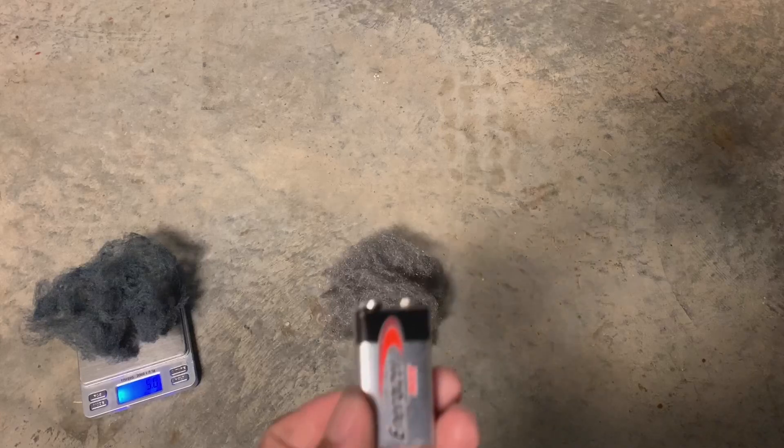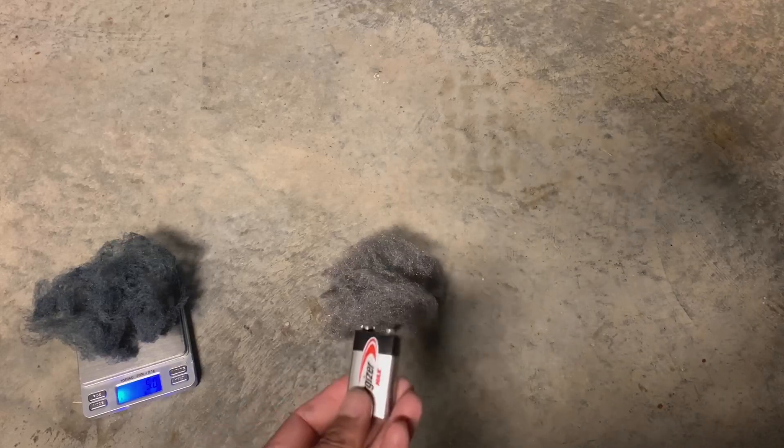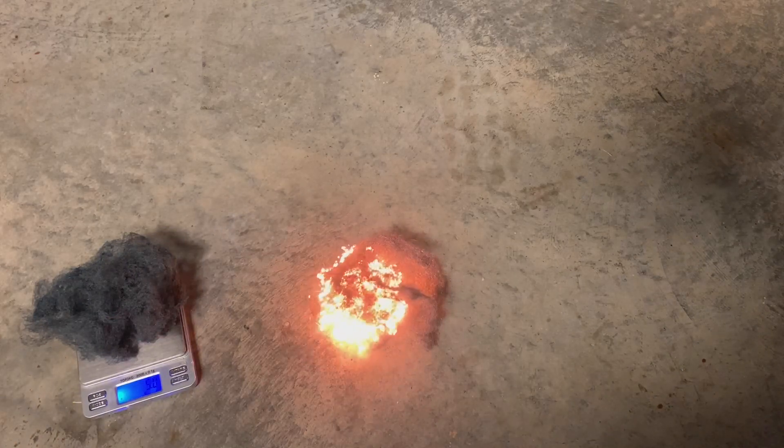So here's some more, and you'll notice the difference between the two. This one is iron oxide now mostly, and this one is still iron. I'm going to put this 9-volt battery on it instead of a flame. Here it goes — and that acts just like a flame.